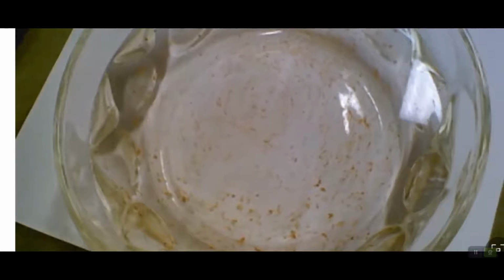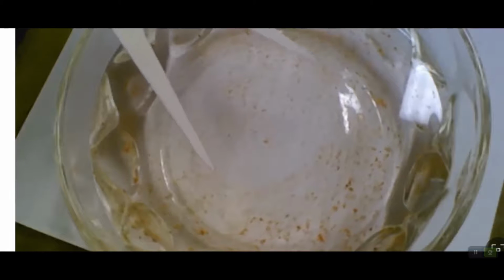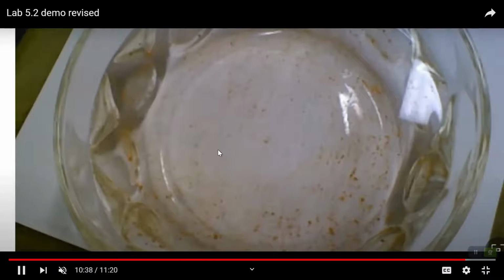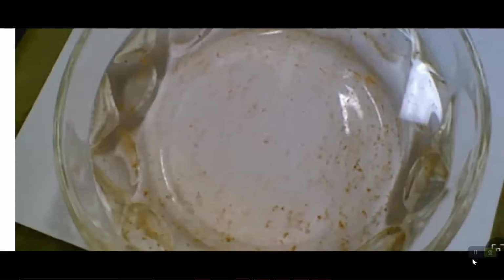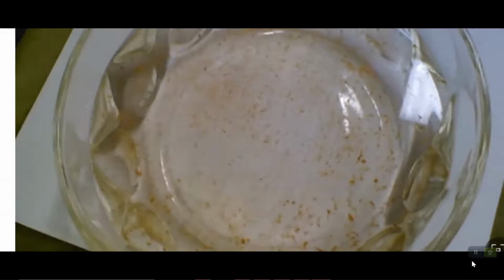You may have to dump out that water, rinse out the bowl, and then put fresh pepper in, because if you get too much soap in there, it doesn't work the way it's supposed to. But that's the idea about how you are going to put a drop of water on there and then measure that micelle. And I think that's everything that I have to show you with that.